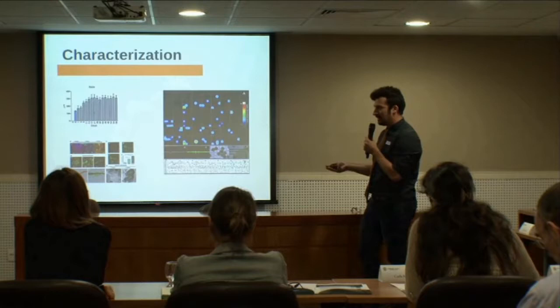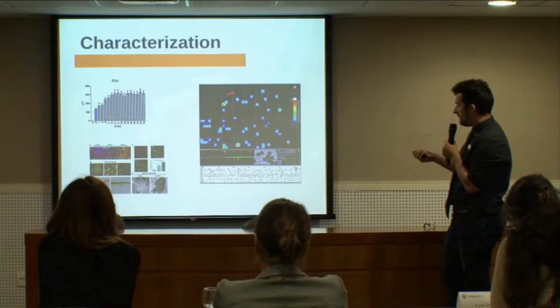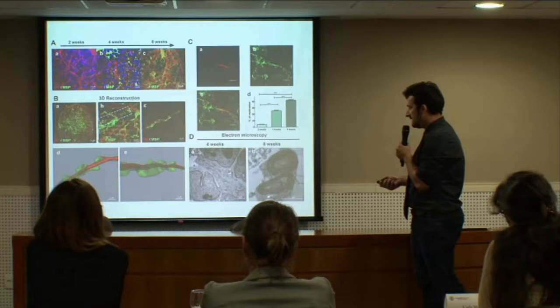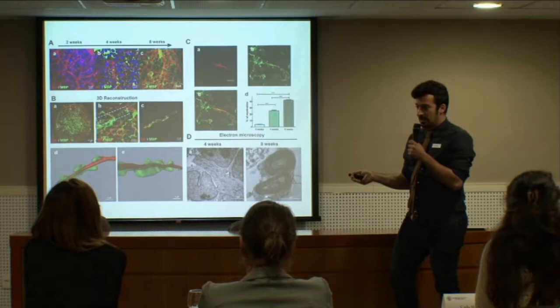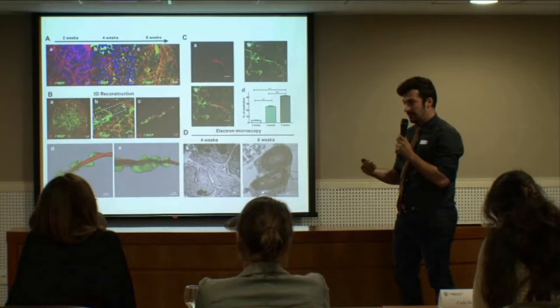And as well, we did some electrophysiological activity. We used the Axion platform. And now we're trying to work more with EPA to develop our model better and see which neurotransmitters and receptors we have. Something that we found really interesting is that we could obtain 40% of myelinating axons. And myelination has been a really big problem, not only in toxicology, but in several diseases. And it's really hard to get myelinating axons in 2D or in vitro models. So that could be something interesting to study for developmental neurotoxicology.